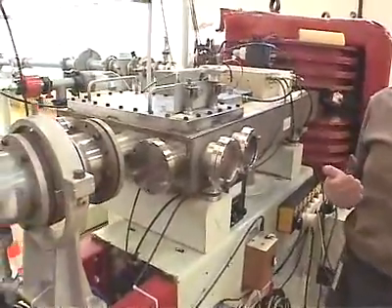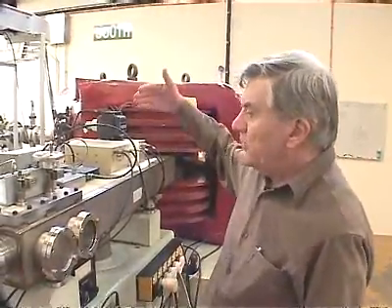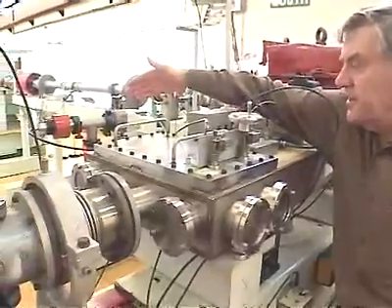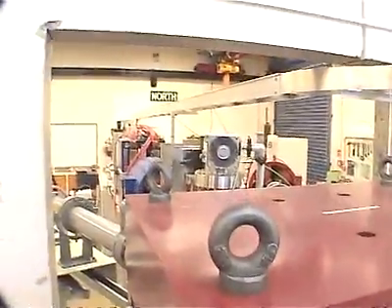This magnet acts very much like an old cream separator that used to be on dairy farms. You put the milk and the cream together, you spin them very fast, and the heavy cream goes to the outside, the light milk goes to the inside. And that way we can make the cream come out through one spout and the milk out through the other. We're going to do exactly the same thing with our carbon atoms. The radiocarbon atoms that we want to measure are heavier than the ordinary carbon atoms. So the lighter ordinary carbon goes on the inside of the track in this direction, while the heavier radiocarbon comes straight out past this tube down towards the other end where we have our detecting device.